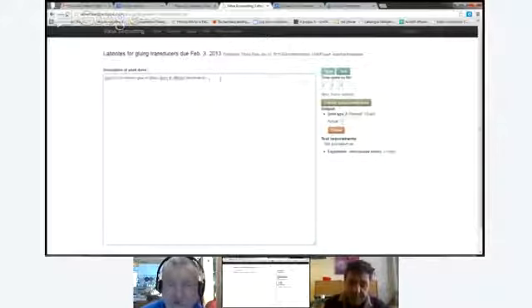Well, when you submit a time contribution, that means this process has started, and it will mark that. When you go back to your working process, you will see that it has been started. You might not be finished yet, so you might want to add more time.